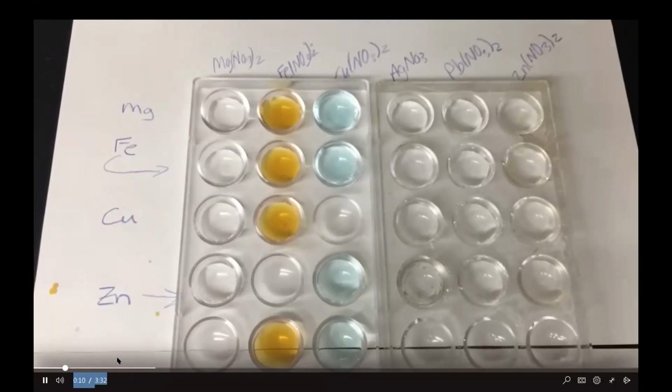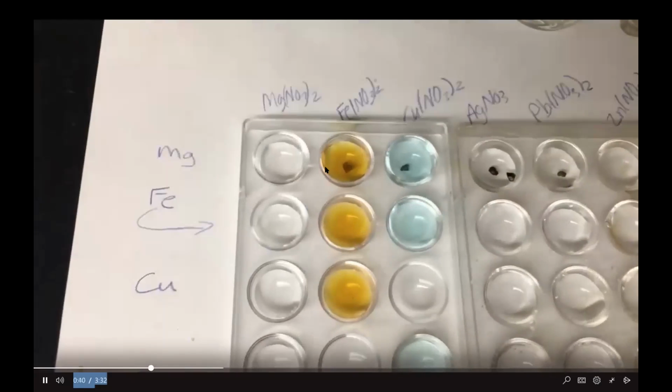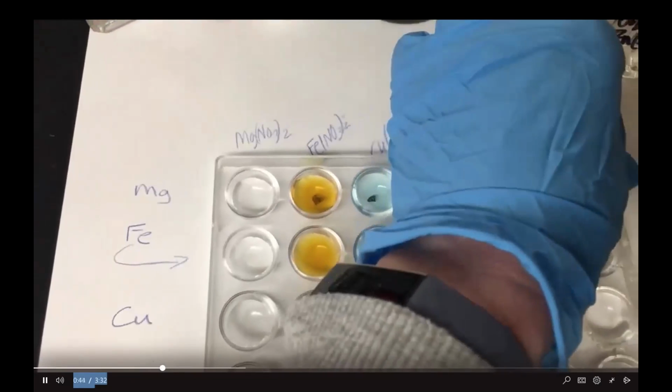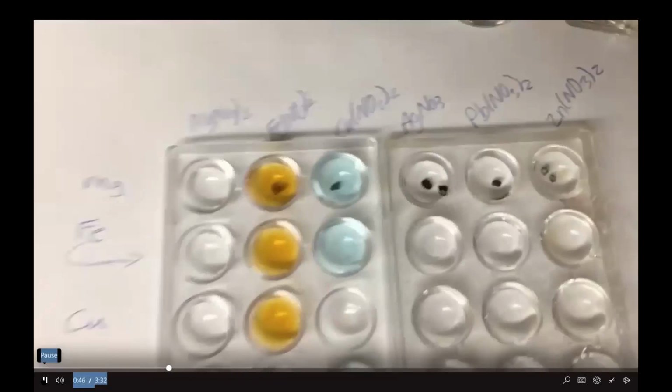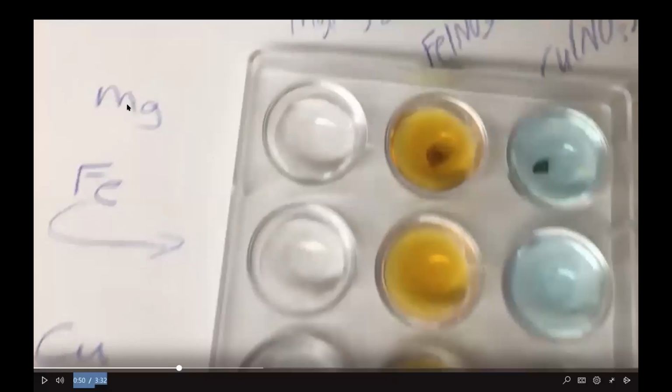So anyway, you just dump in the different kinds of metals in the different solutions. So these are pieces of magnesium going in with each of the different substances. In the first one, there's just a description, or in this video, there's just a description of them going in. And then we get back.